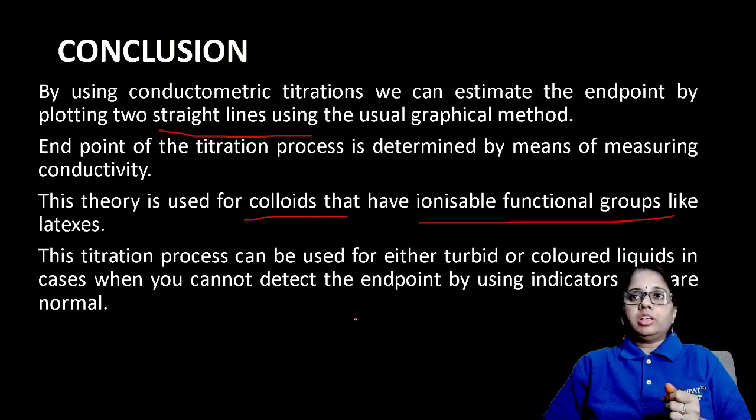where endpoint determination by indicators is normally used, but somehow difficulties are going to be there. All those difficulties can be overcome by these conductometric titrations.